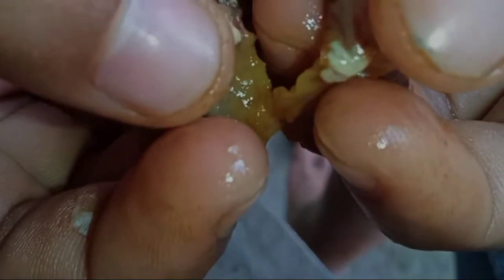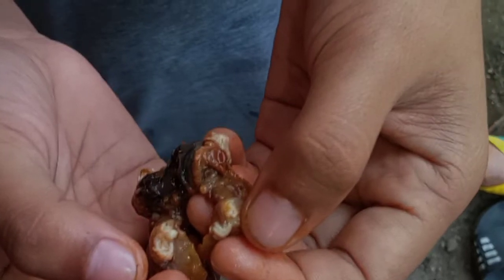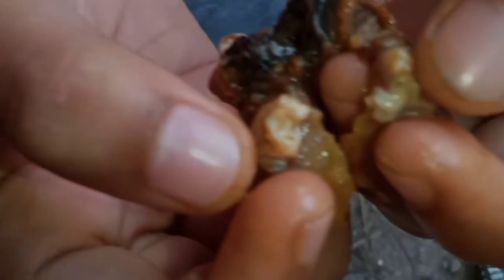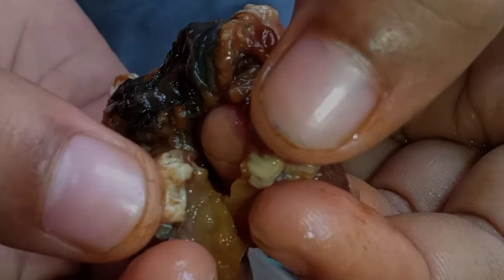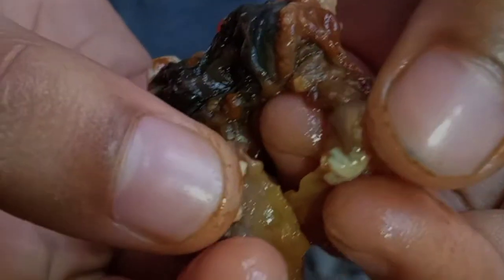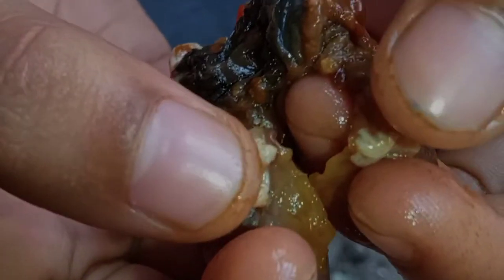The stomach. The large gills filter food from the water and direct it to the labial palps, which surround the mouth. Food is sorted and passed into the mouth. A short esophagus leads from the mouth to the stomach, which is a hollow chambered sac with several openings.